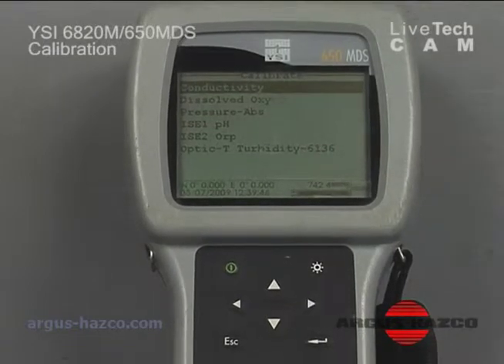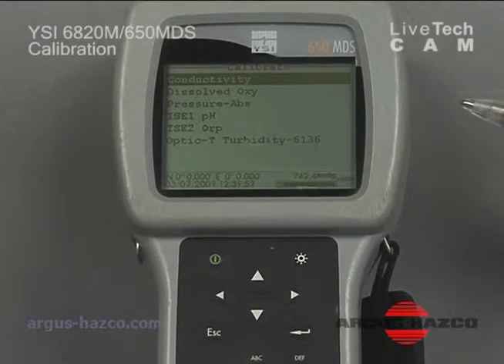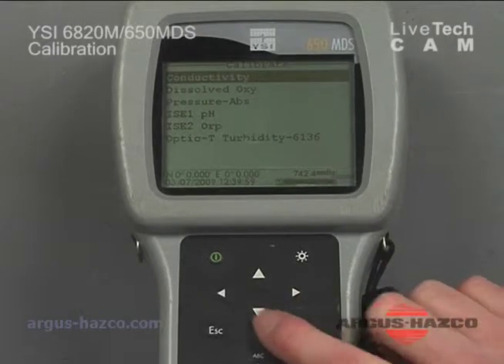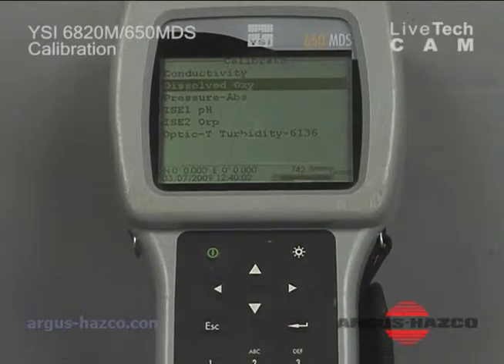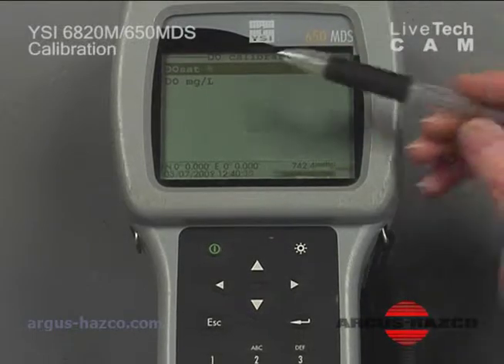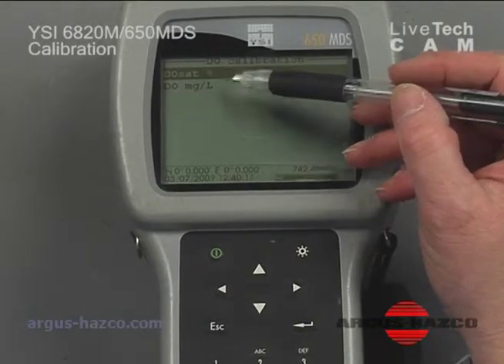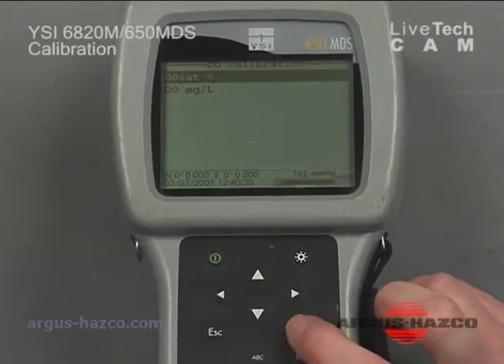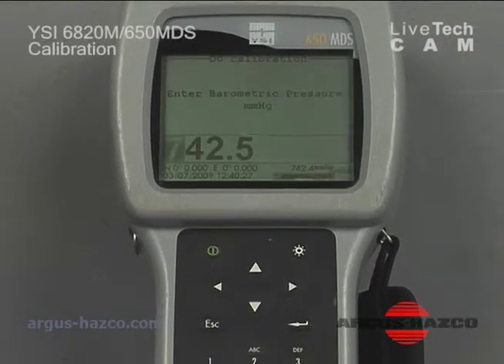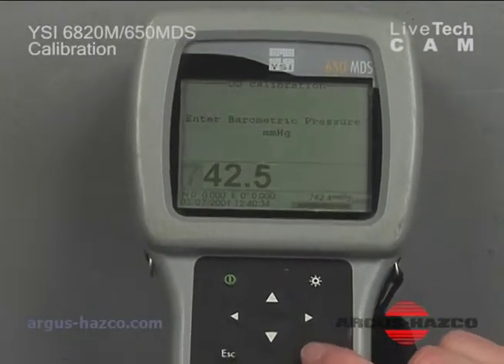We're not going to go through calibration of every single probe. We're just going to calibrate the dissolved oxygen here for demonstration purposes. But you do need to calibrate these sensors before each use. So now we select the sensor we want to calibrate. I'm going to calibrate dissolved oxygen and press enter. Our next choice is between dissolved oxygen saturation or dissolved oxygen milligram per liter. Select dissolved oxygen saturation, hit enter. Right now it's going to ask for our barometric pressure. We enter in our local barometric pressure, and to change the numbers you can just use your keypad. This is our correct pressure, so I'm going to hit enter.